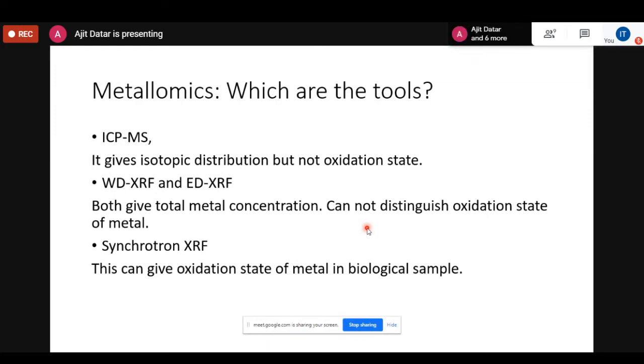except a few elements in between, which are your rare gases, helium, argon, neon, etc. Those cannot be analyzed, while most of the other elements are possible to be analyzed at different sensitivities. Maybe nitrogen and carbon, at very low detection limits, are not really very good, but they can be measured.